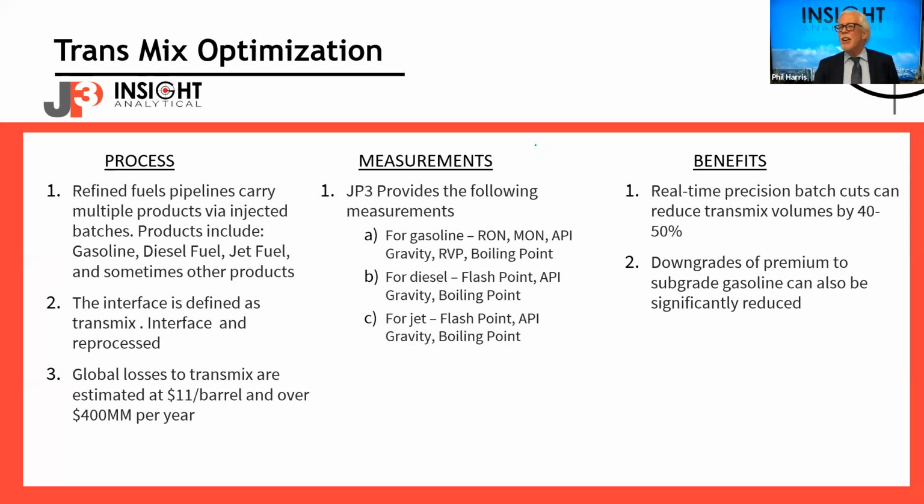How many lab samples, and how long, need to be taken for the Chemometrics standard reference graph? Good question. It's one that comes up a lot. It depends, it's certainly application driven and depends on how much variability there is in the product.